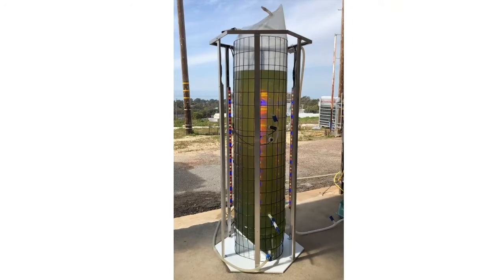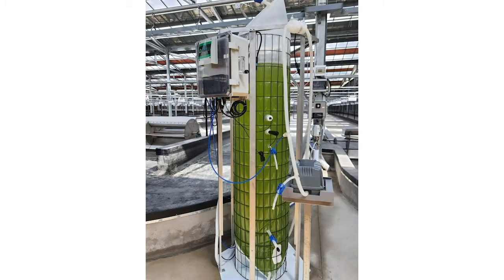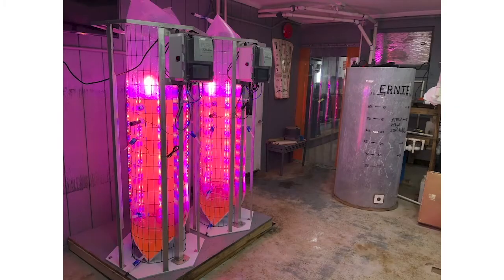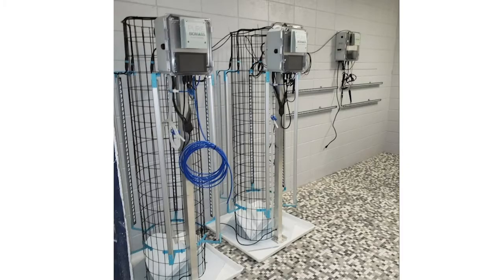Some of our customers in Hawaii have created simple heat exchangers which utilize cold, deep-sea water for cooling of their cultures, which has proven to work quite well. Once the 250-liter systems reach peak density, they are used to inoculate our 1,350-liter systems and any other scale-up reactors or tanks down the line.